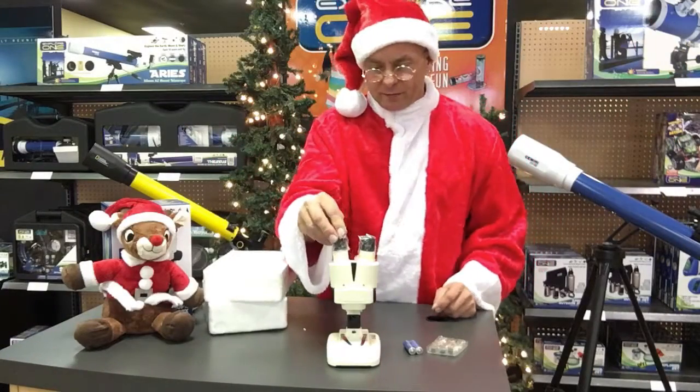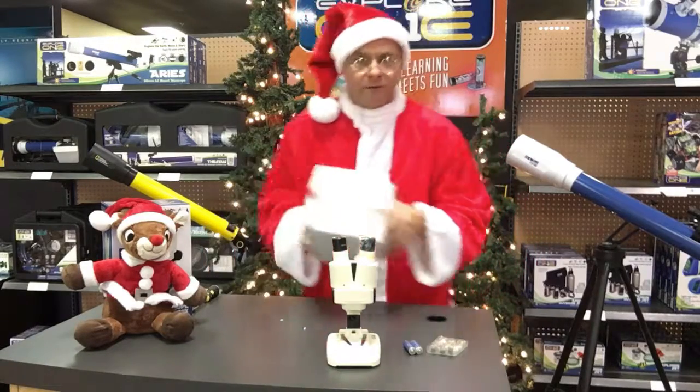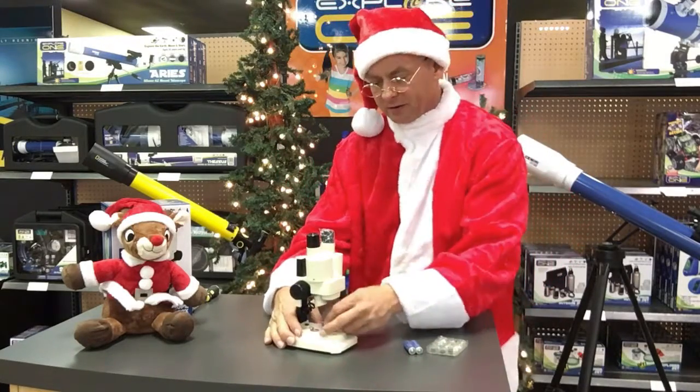The eyepieces are covered with little bags, so we're just going to pull that off. We're going to set this styrofoam aside here. And we're going to start setting up this microscope. We have one more bag to pull off here as well.